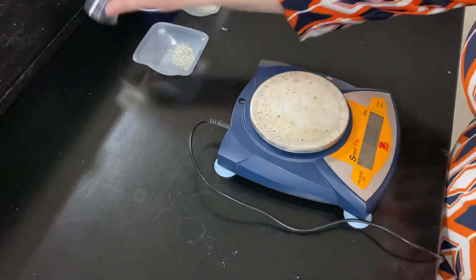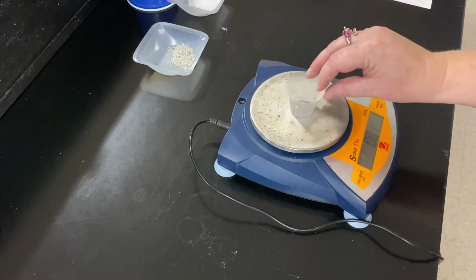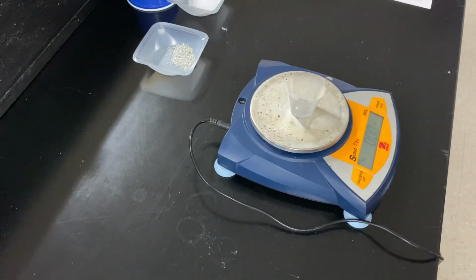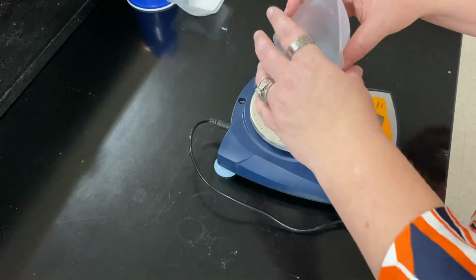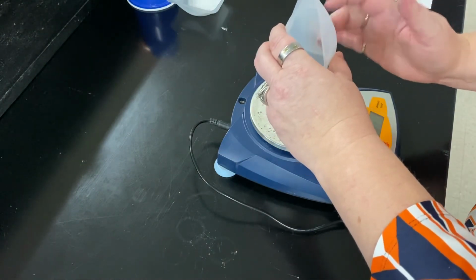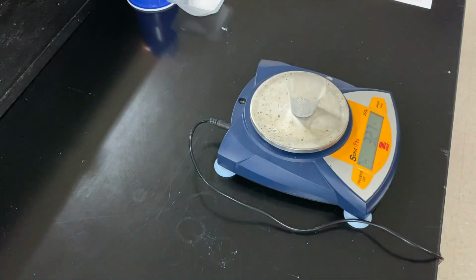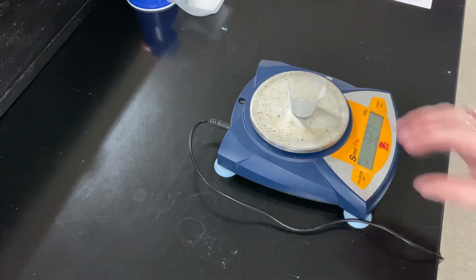Okay. Now we're going to determine how many atoms are in a sample of aluminum. I'm going to put a container, I'm going to zero it out, and now I'm going to add the sample of aluminum. Let's make sure we got it all. All right. Our sample of aluminum is 3.27 grams. 3.27, that can be read right down here on the balance.